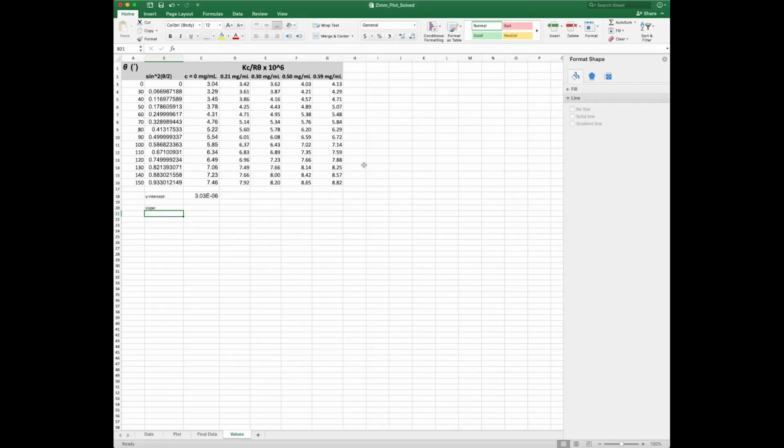Okay, so whichever approach you take, whether fitting as a function of concentration or fitting as a function of Q, you're going to get the same y-intercept as I showed. But if we want the second virial coefficient, remember from Zimm's equation that we need Q equals 0 to simplify the term with the form factor, and we need the scattering data as a function of concentration.